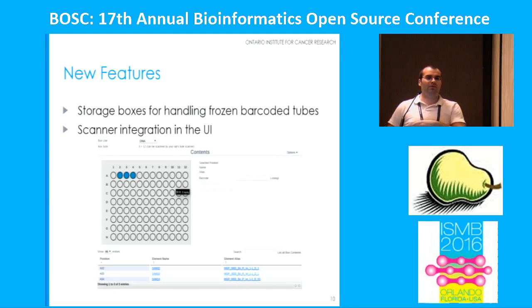It's that way forever. The storage boxes that we're talking about are generally holding barcoded tubes, and you can shuffle things around. And in a lot of cases, it's part of the workflow of, okay, go get box whatever, take all the samples in it, do procedure X on them, and then put them into box Y, and someone else will pick them up and take them on to the next step when those are manual steps. And then a lot of those tubes will end up as, now it is in freezer 5 as a final resting place. So we wanted to do that.